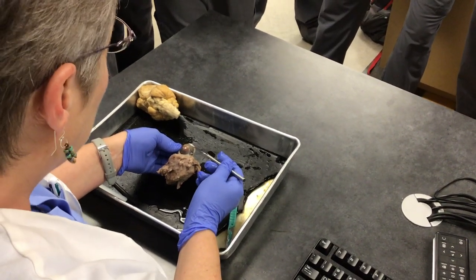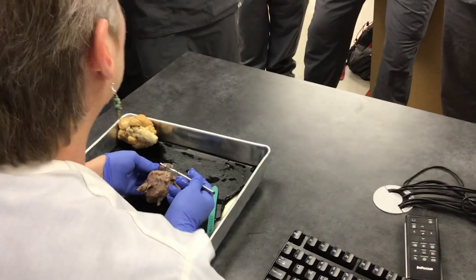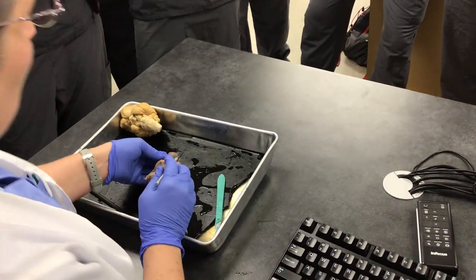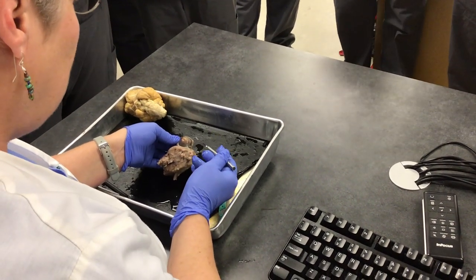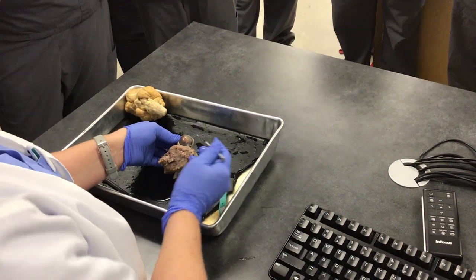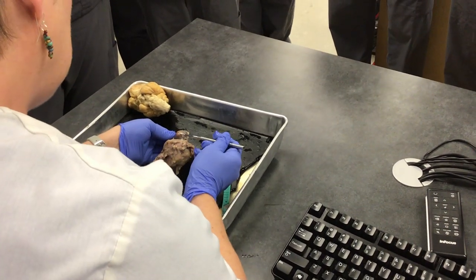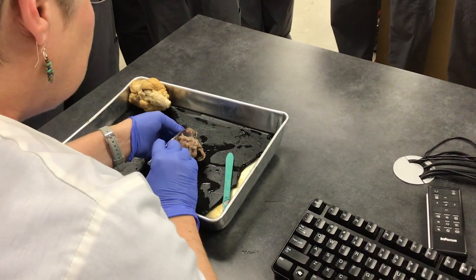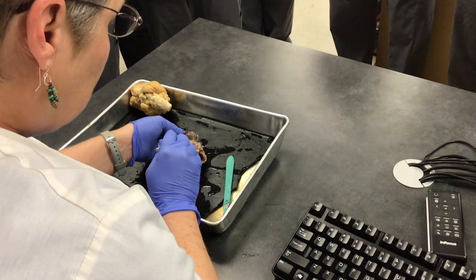Do you remember towards the beginning of the semester, we talked about proteins and how they become denatured? The cornea in life is very clear — it has to be so we can see out of it. But in death, those proteins become denatured and that's why it's so cloudy. But this is the cornea.